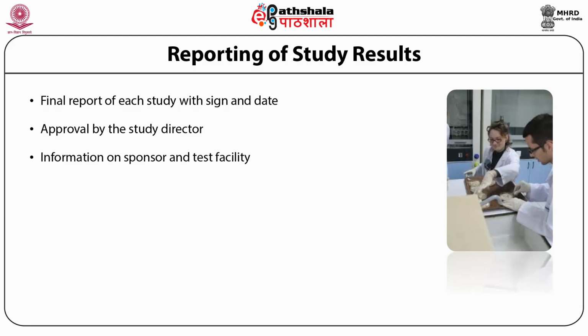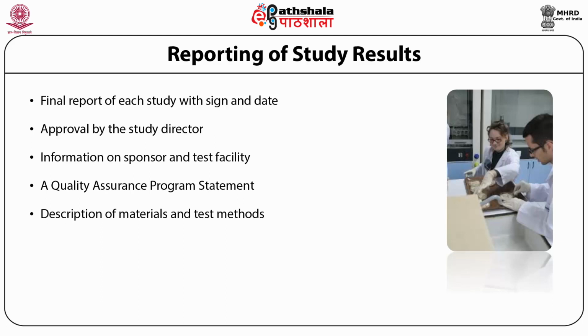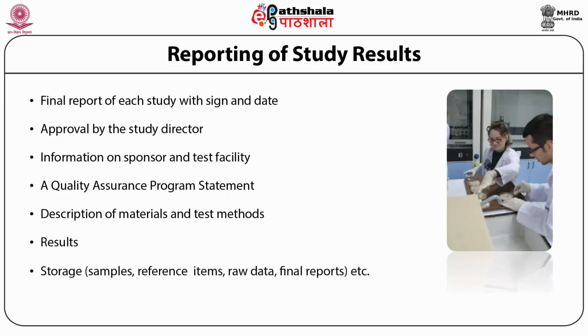This report includes the quality assurance program statement, description of materials and test methods, results and storage, which include storage of samples, reference items, raw data, final report, etc.